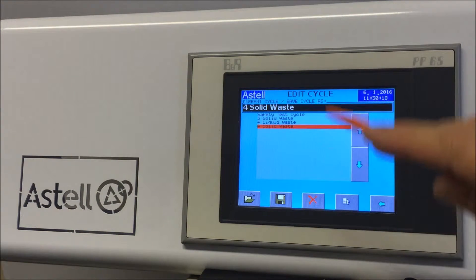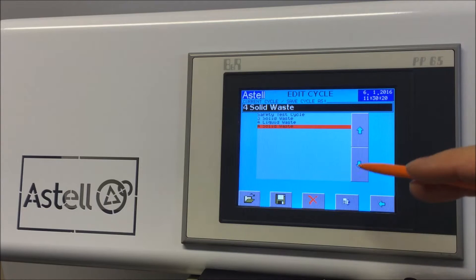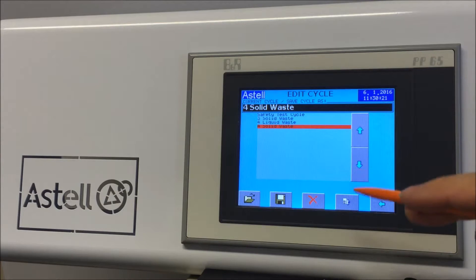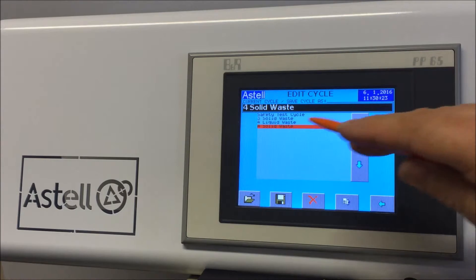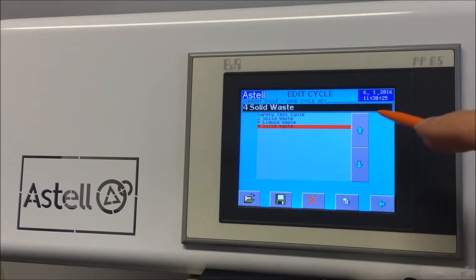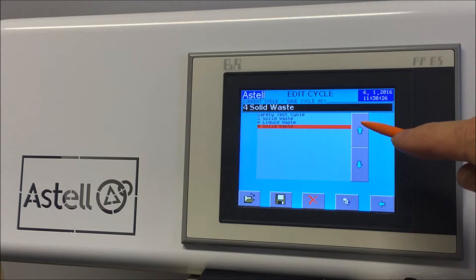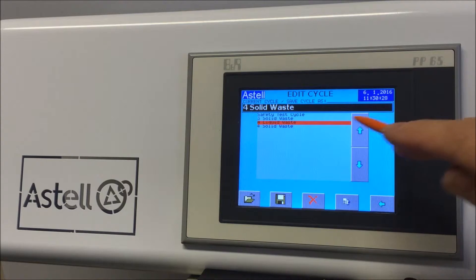Using the up and down arrows, select the cycle you wish to edit. Here we are selecting number 4, the liquid waste cycle. Open the cycle using the folder icon at the bottom left of the screen.